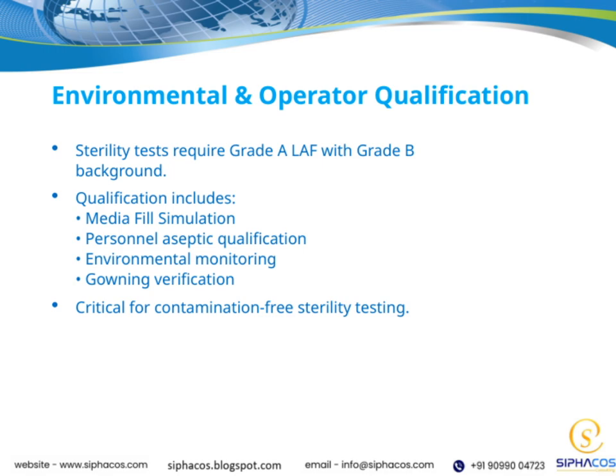And finally, gowning verification, which is about making sure that the proper gowning procedures are followed every time, creating a barrier against contamination. All of these steps are critical for maintaining a contamination-free environment, which is absolutely essential for reliable sterility testing. Remember, the integrity of the testing process depends heavily on both the environment and the operators, so qualification in these areas is fundamental to our overall quality assurance efforts.